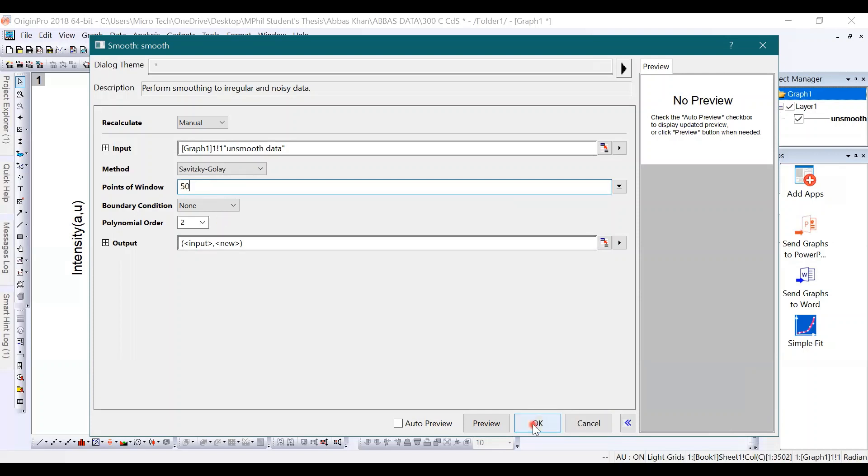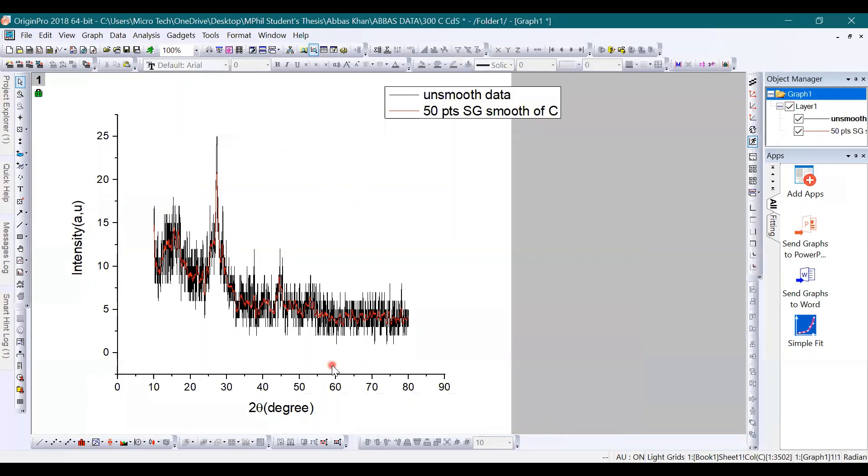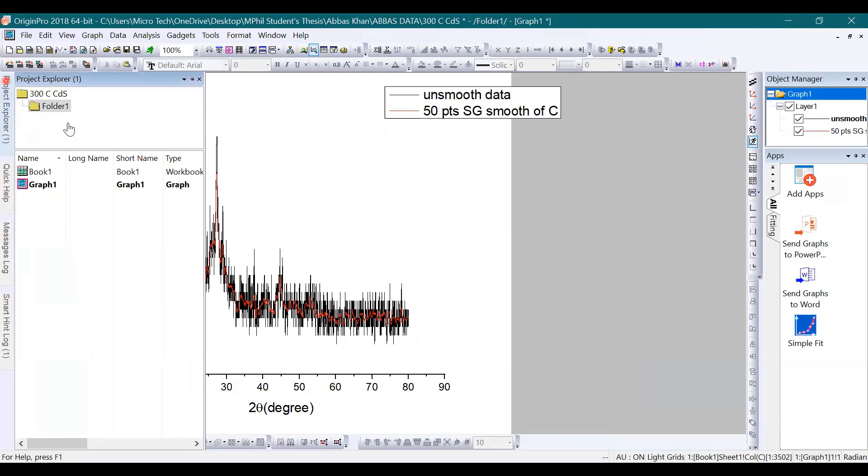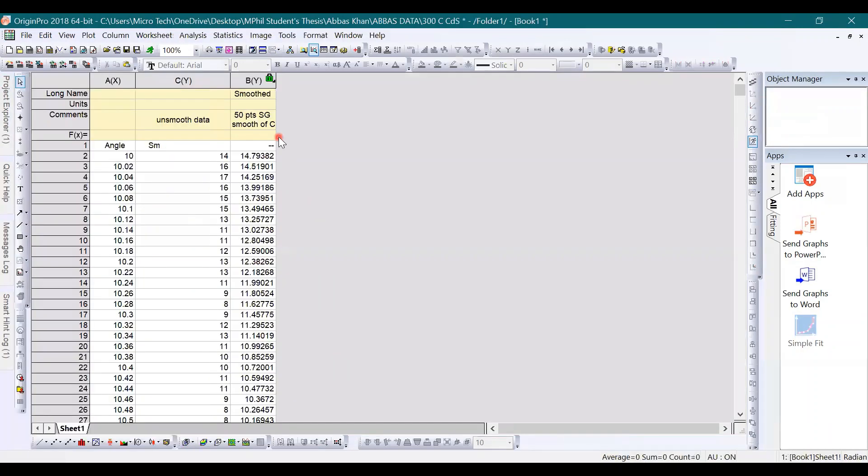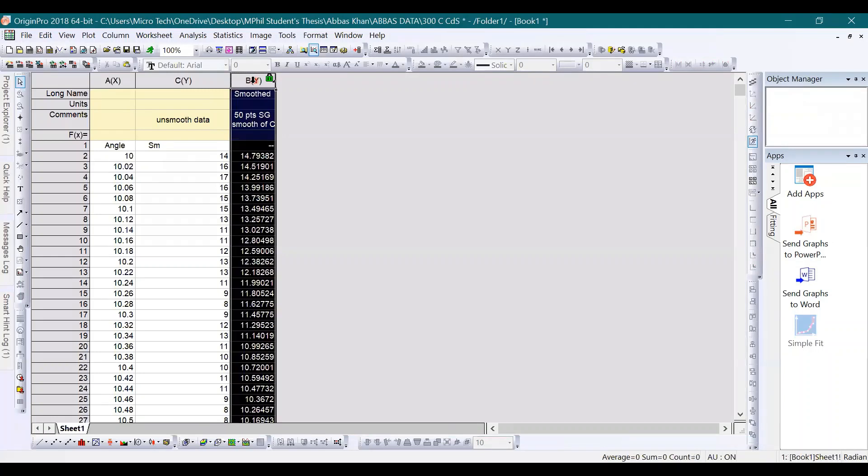By doing this, you have set the smoothing parameters for your data. Now go to the data file where you will see that the smooth column has appeared, and that is here.